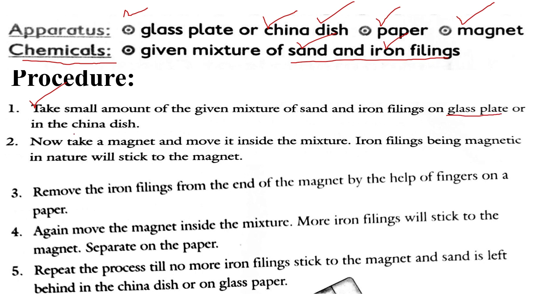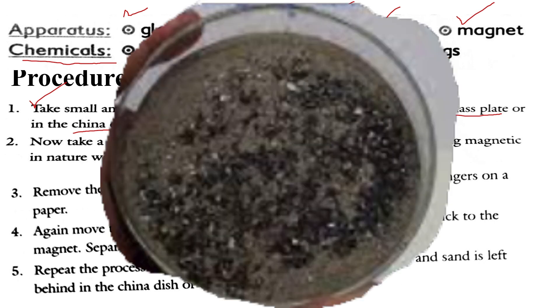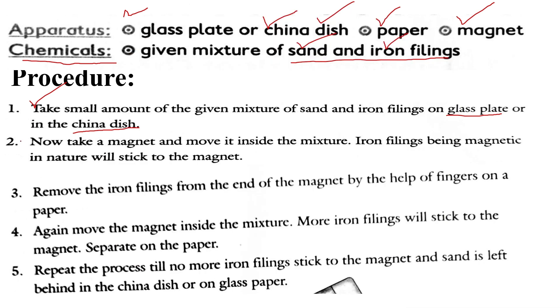We will take a small amount of sand and some pieces of iron fillings, put them into the china dish, and mix them. Now the mixture is prepared. The process is to separate them by the physical method. We will take the magnet and move it inside the mixture in the china dish or on the glass plate.